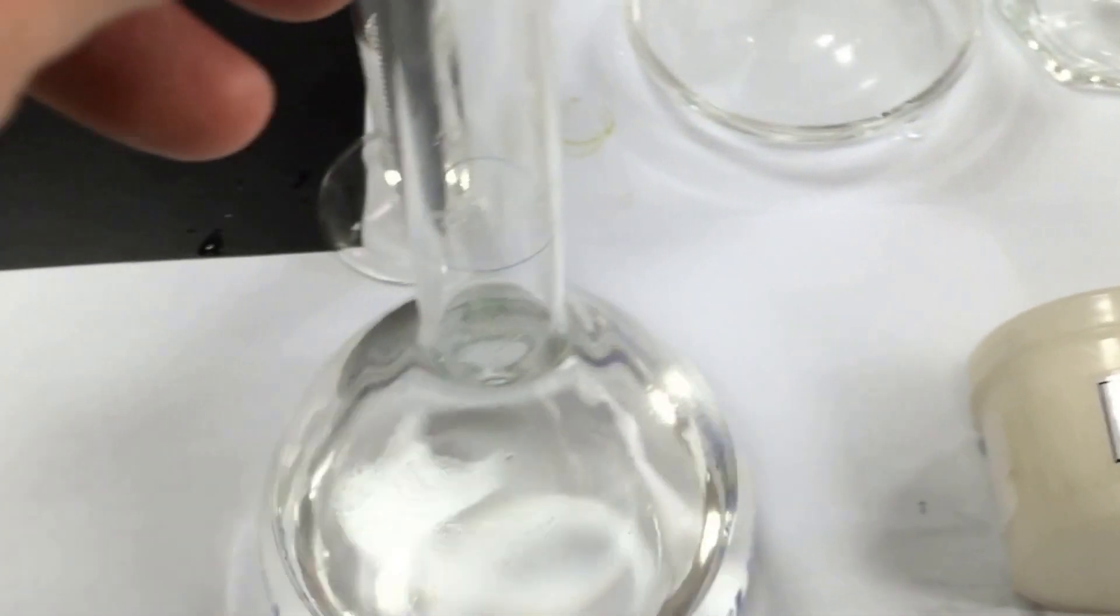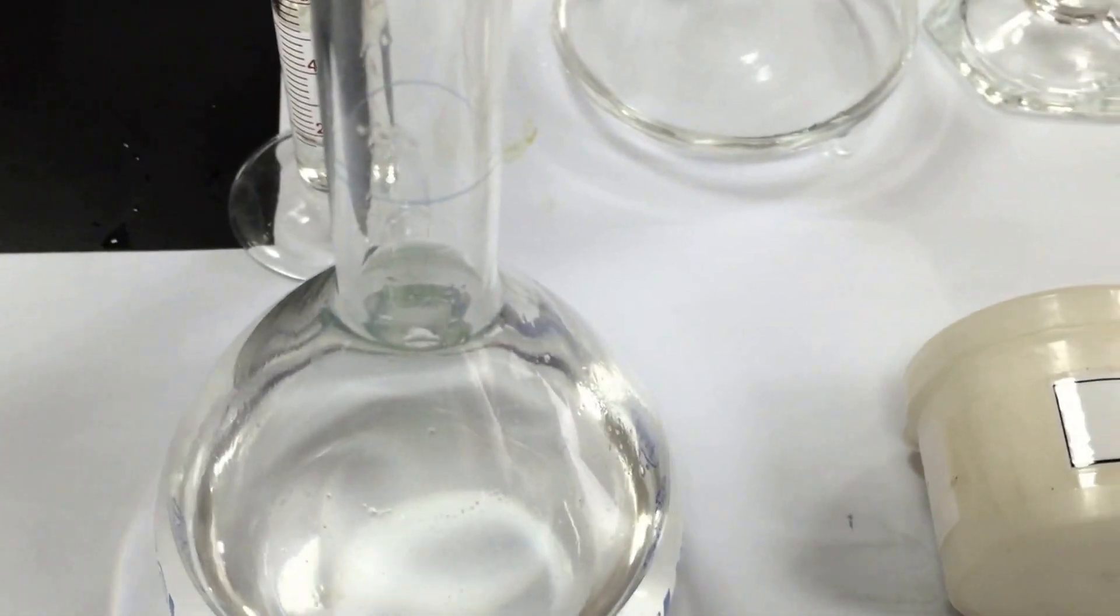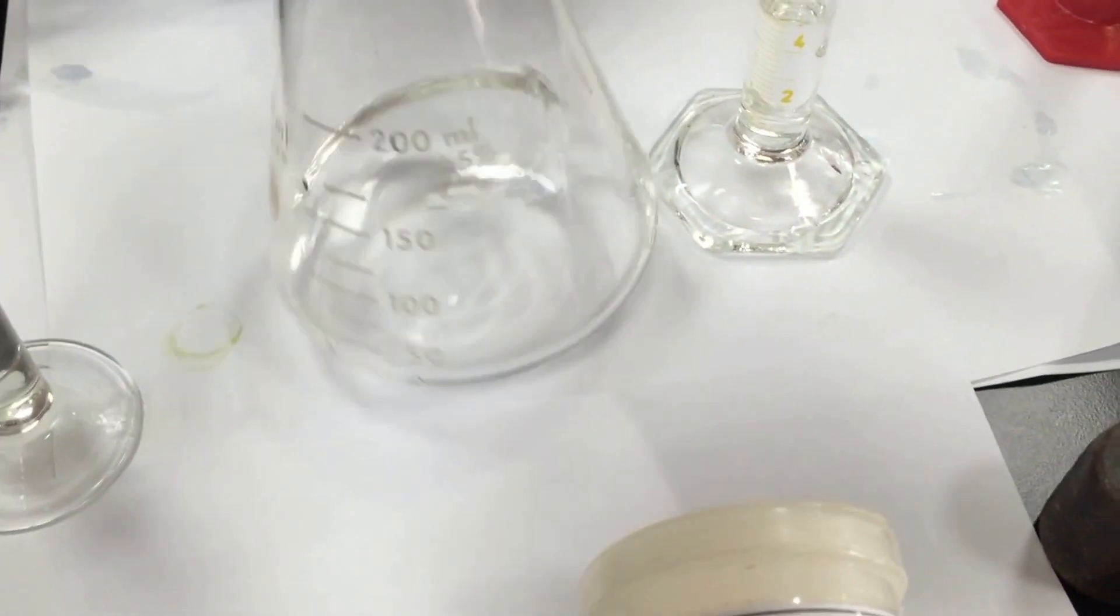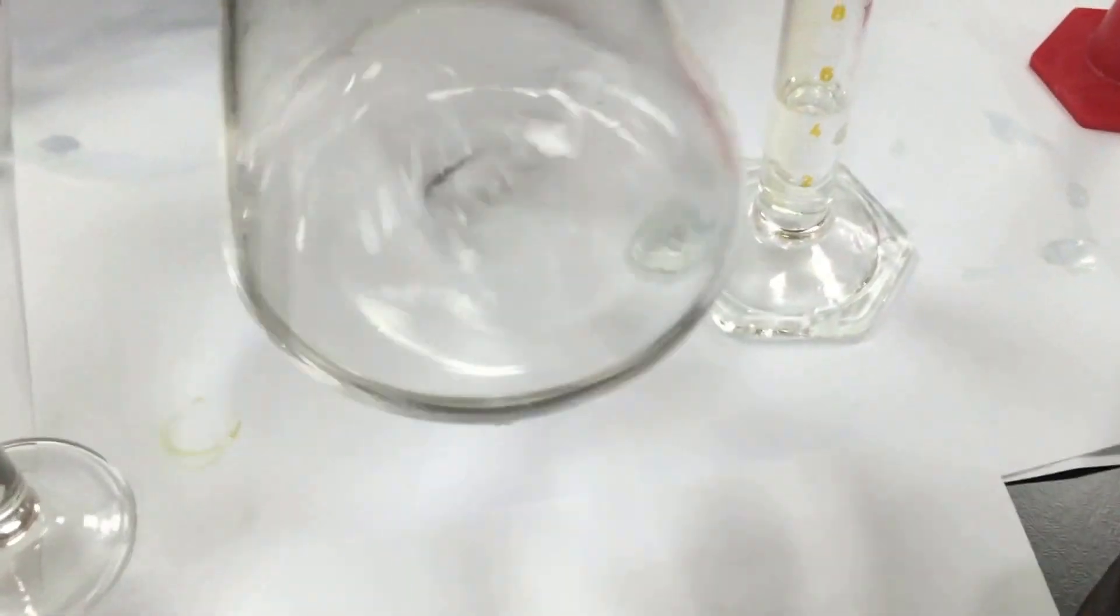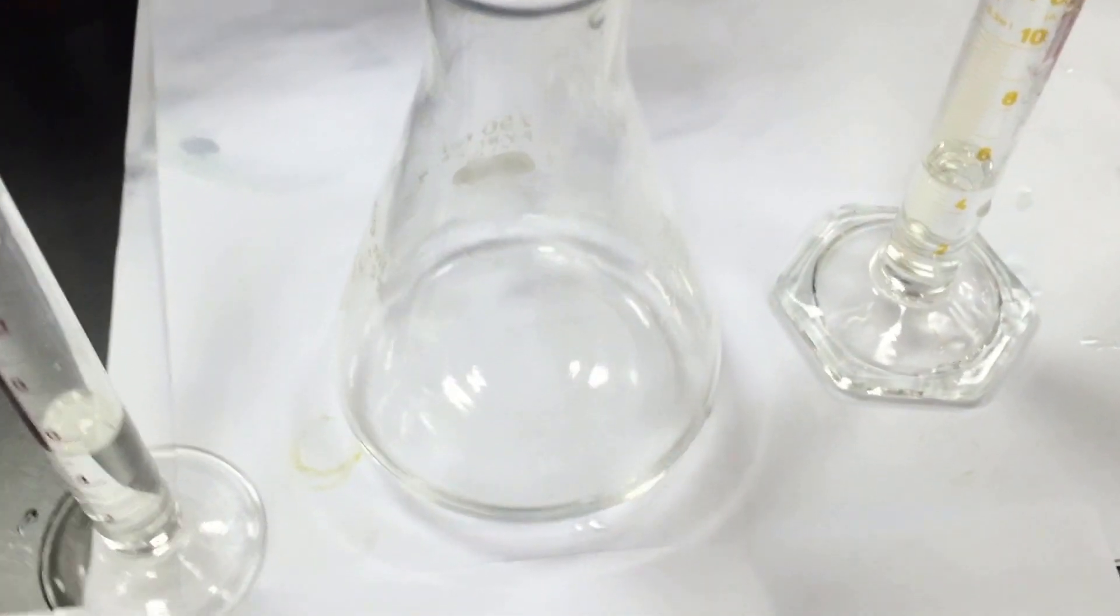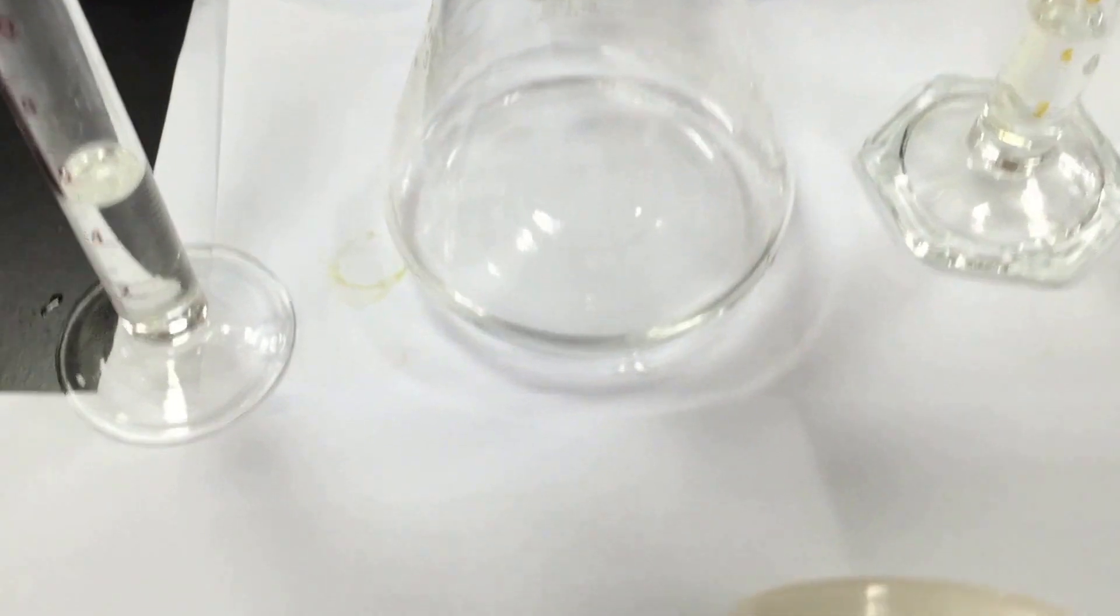I took a 25 milliliter aliquot of my saltwater solution and put it into this conical flask here, which is nice and clean. So we've got our subsample, our sample of sodium chloride, which presumably has some amount of iodate ion in it.